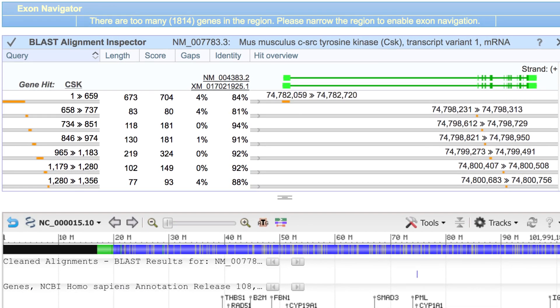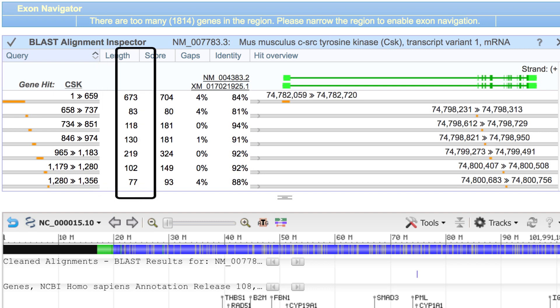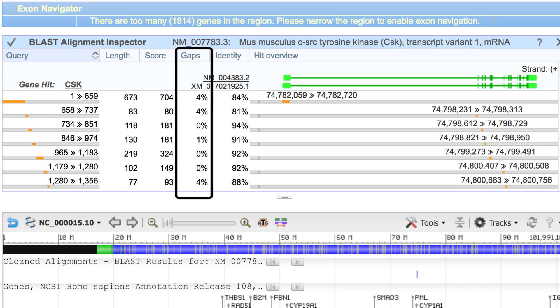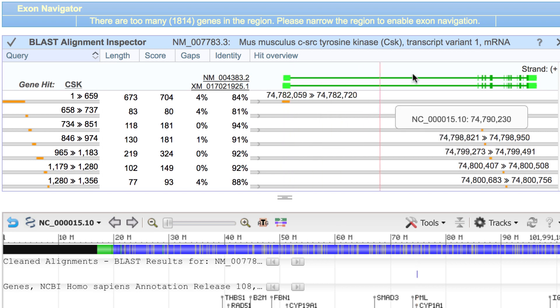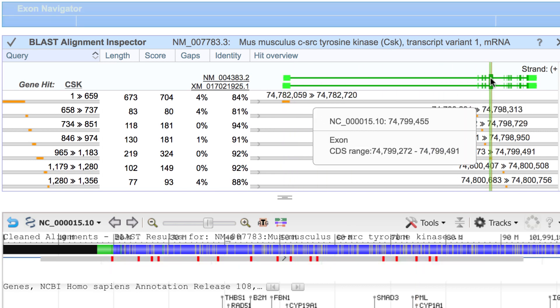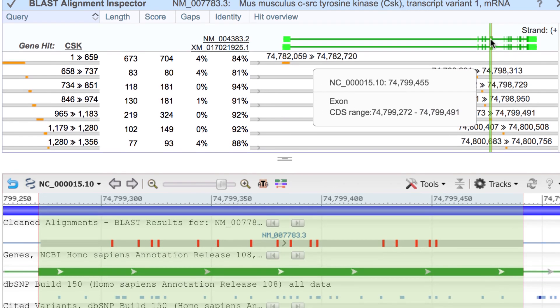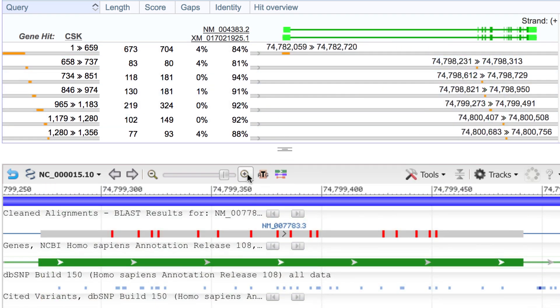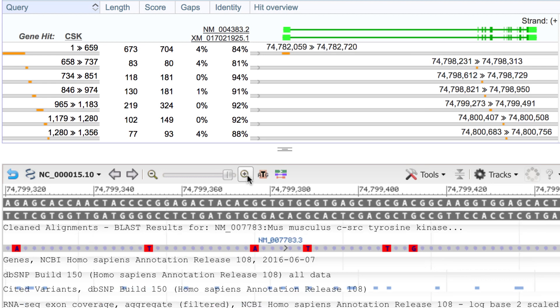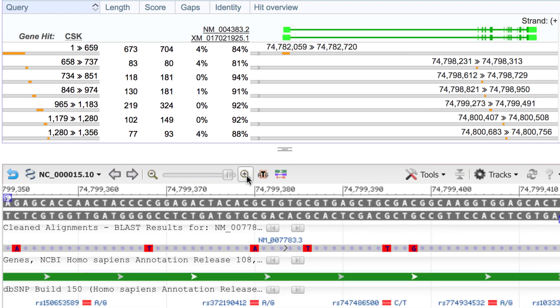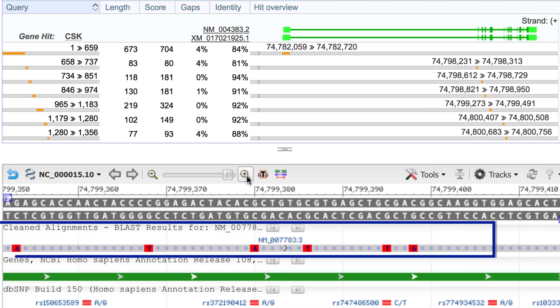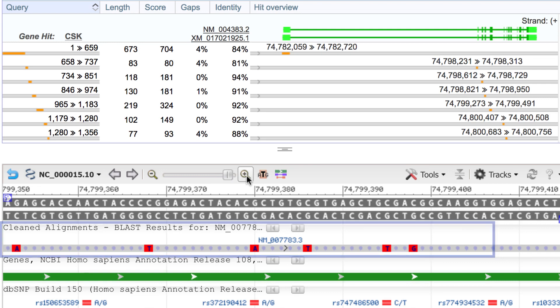The Inspector allows you to easily examine BLAST alignments in a table view, or graphically, all the way down to the sequence level. My BLAST query in this case was a mouse cDNA, so we see many mismatches in red.